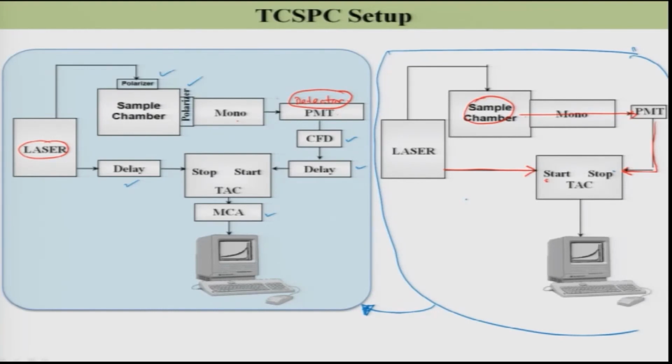Note that here the first arrived photon is not necessarily the first emitted photon. That is the heart of this TCSPC.